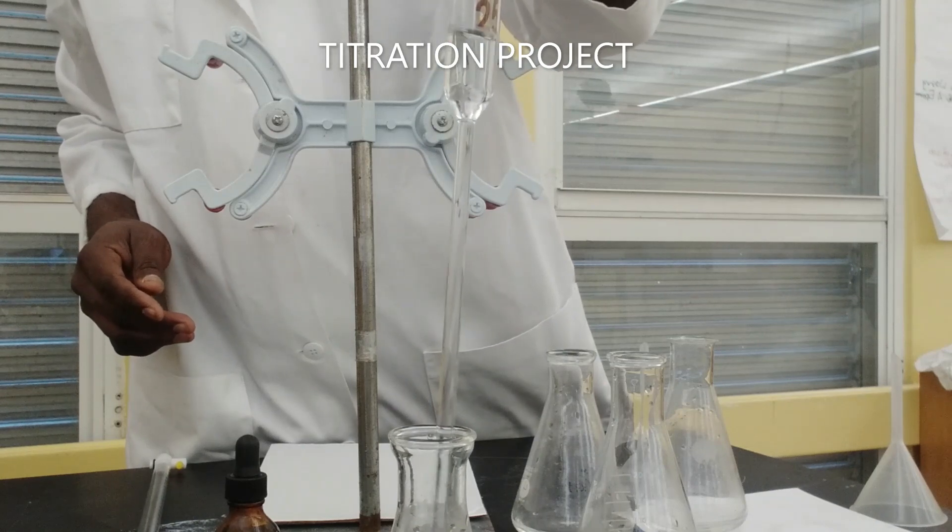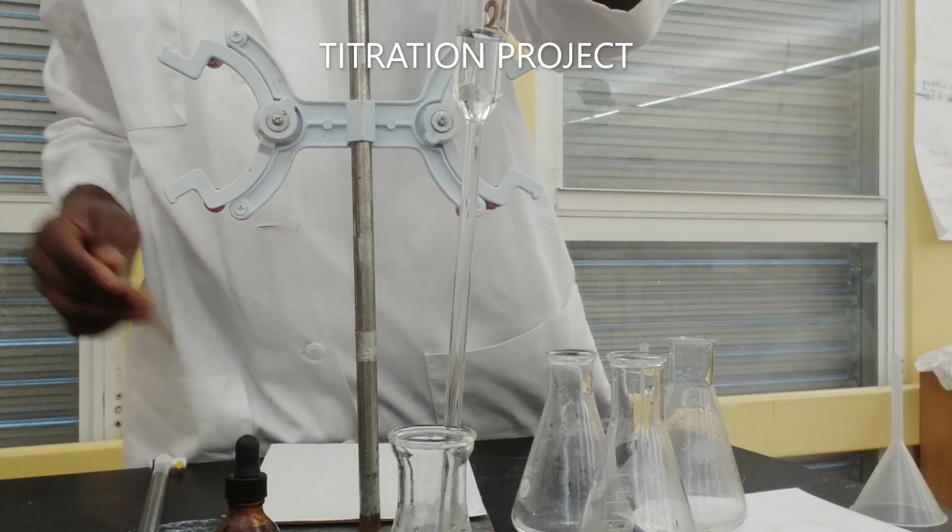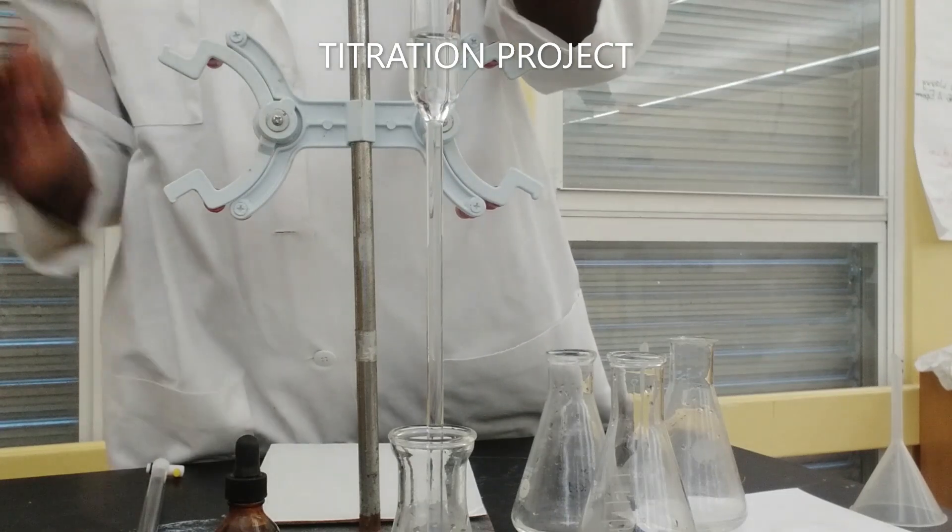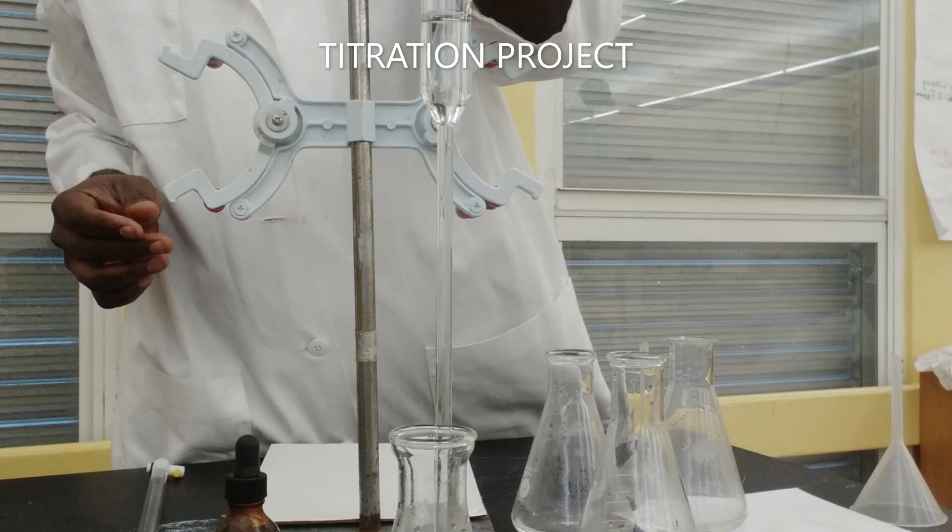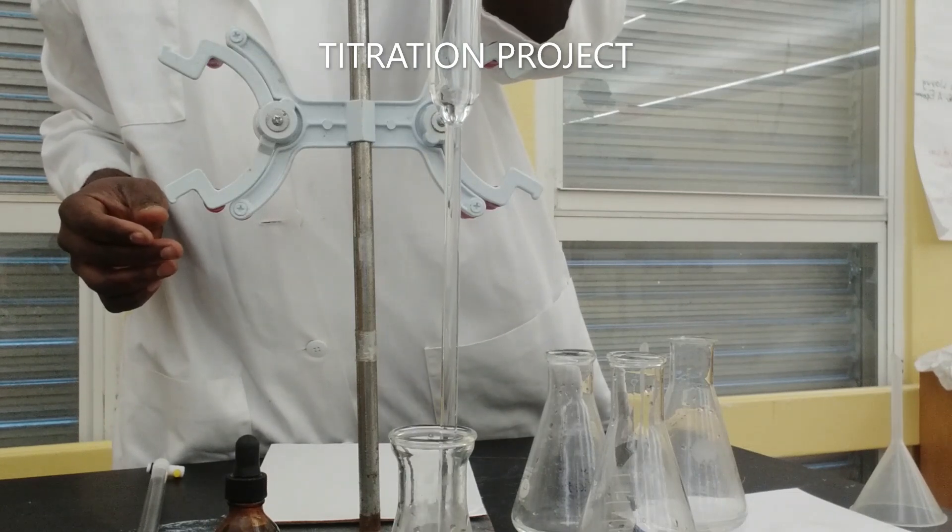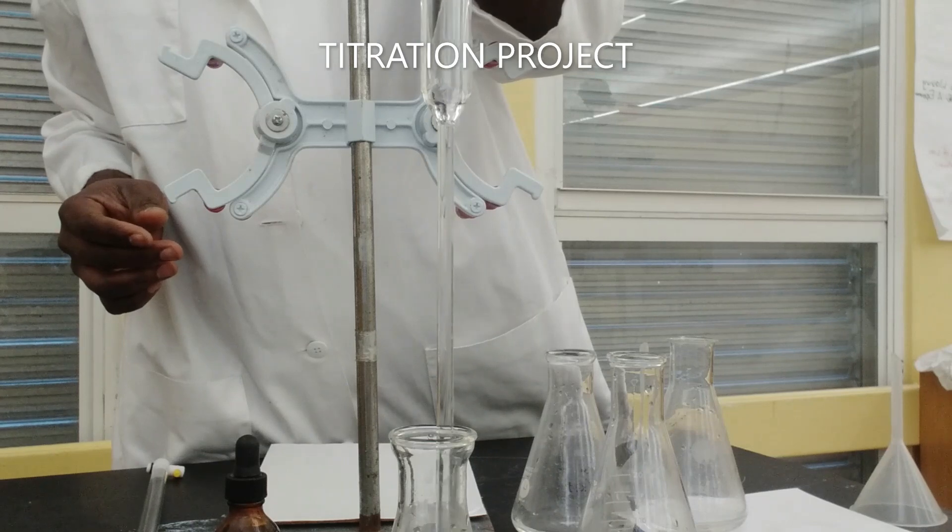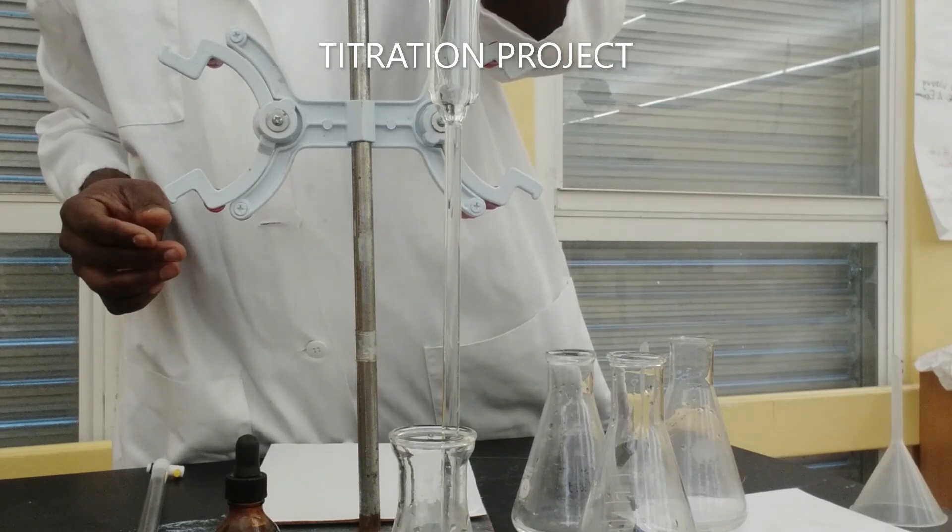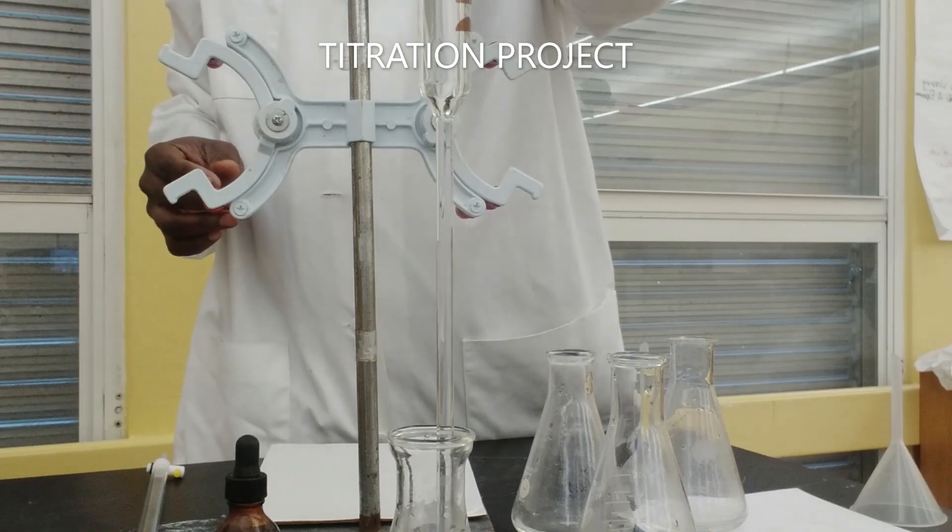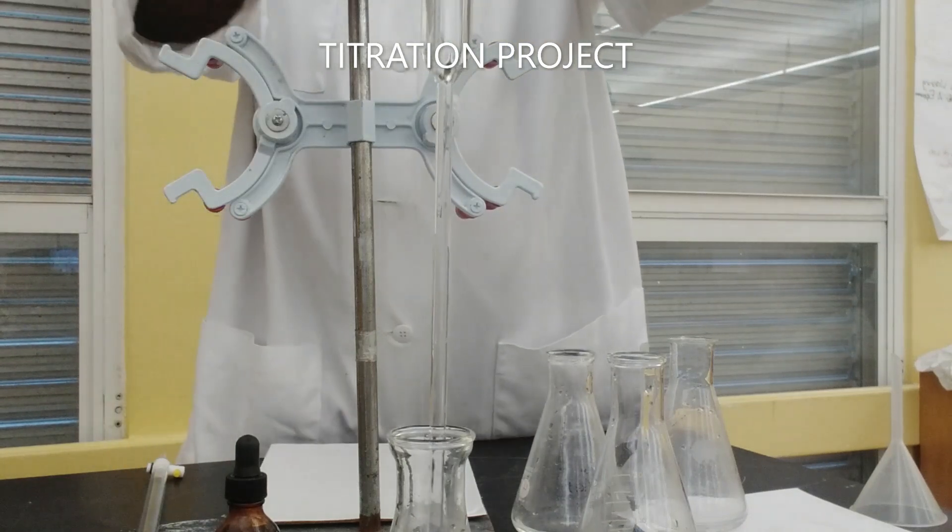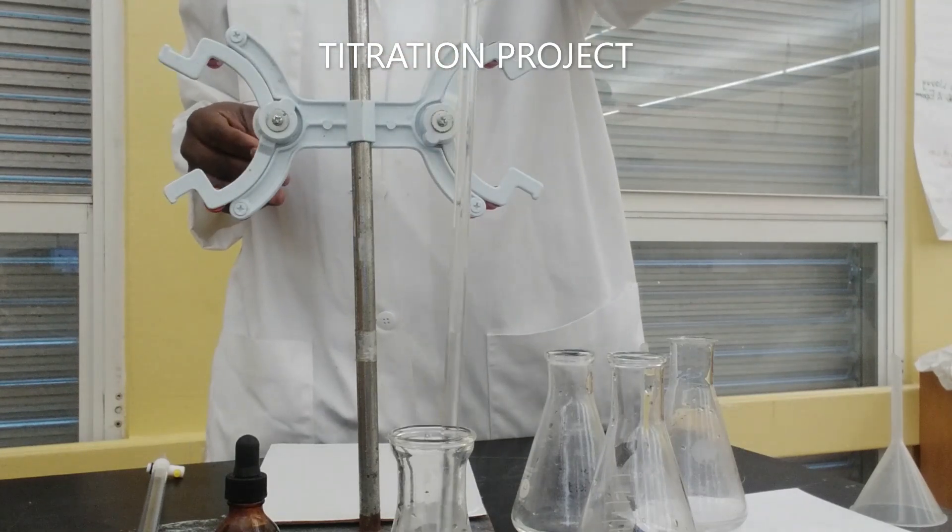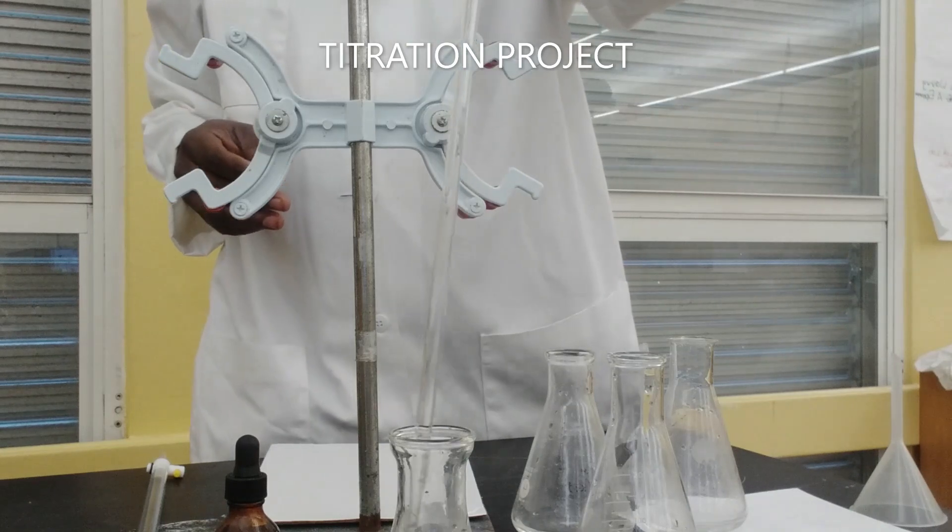Generally, the whole concept behind volumetric analysis experiments or titration experiments is that for acid-base, we just want to establish equimolar volumes. We want to figure out the equimolar volumes required for the acid to be completely neutralized by the base.